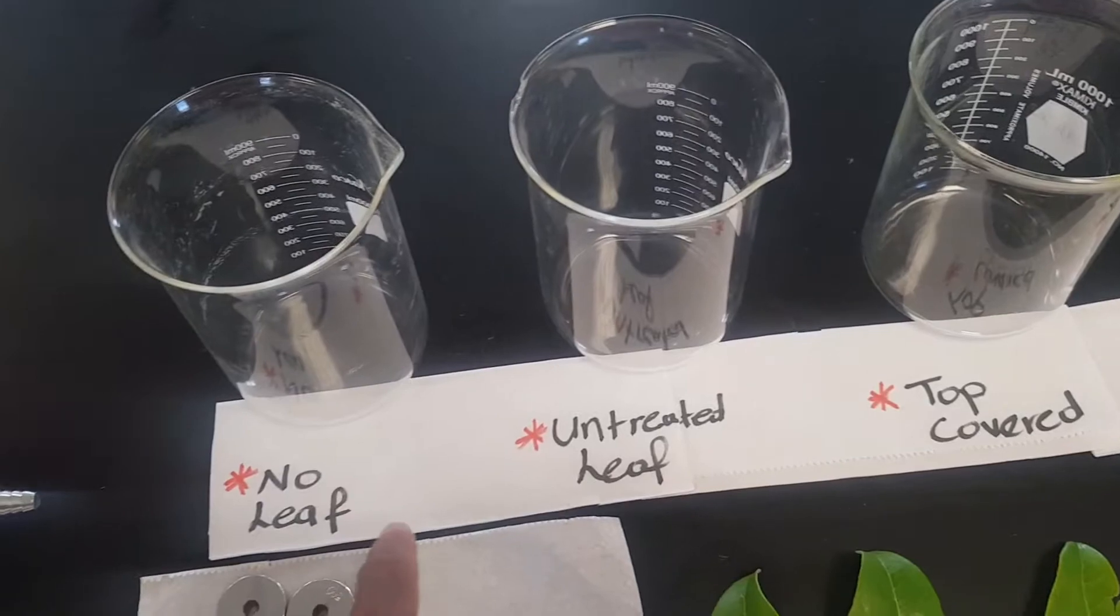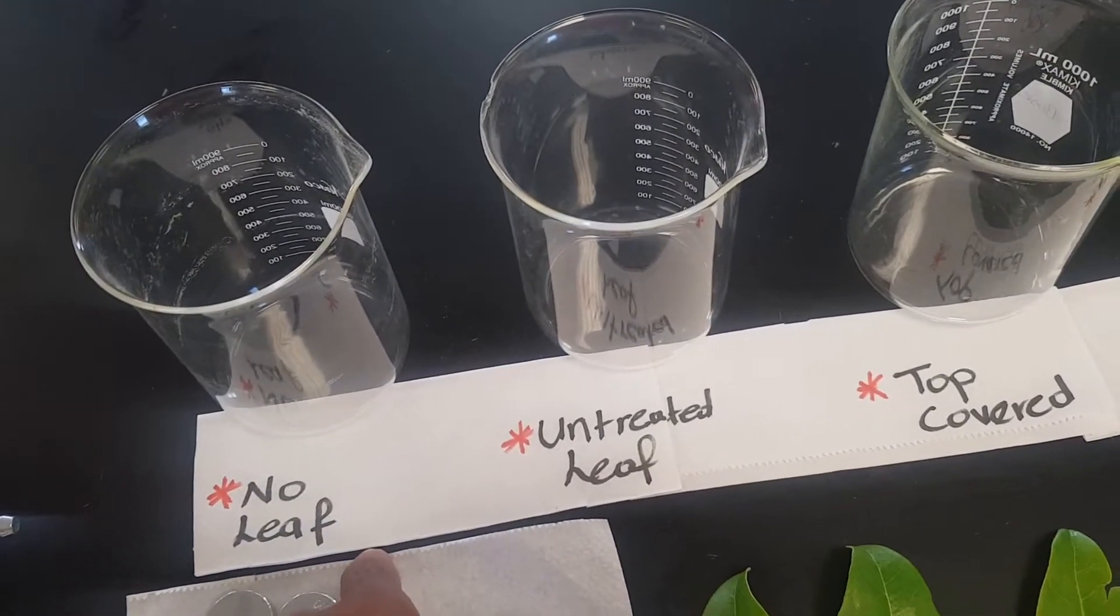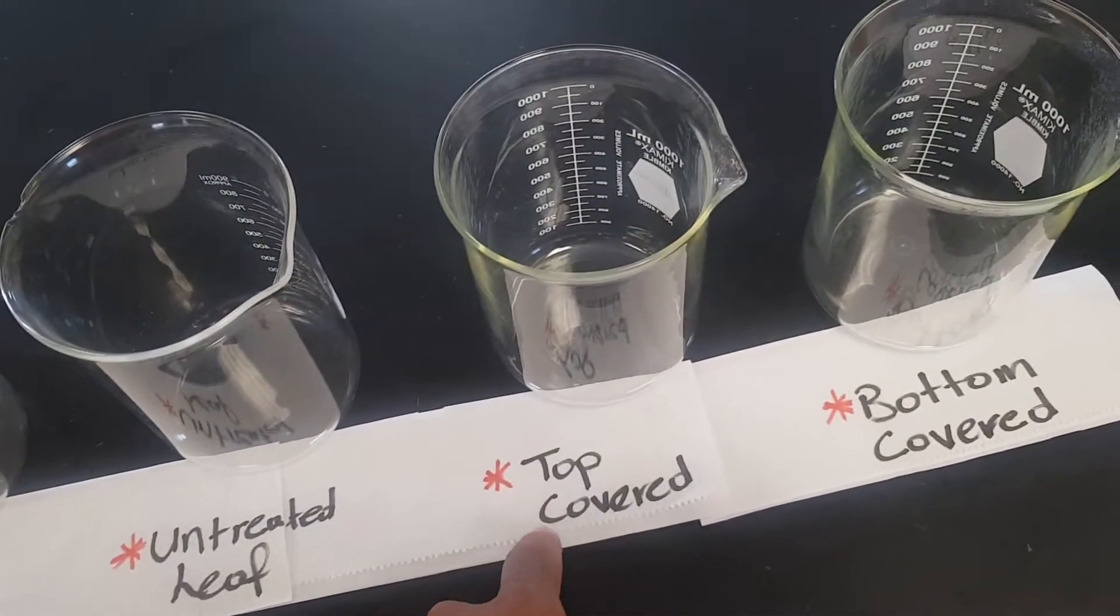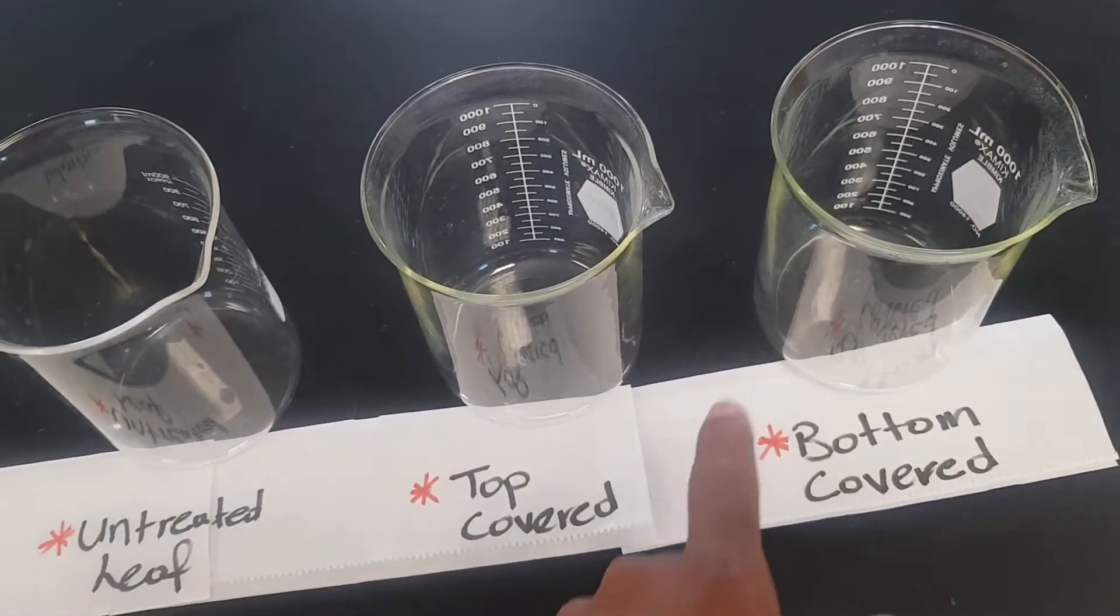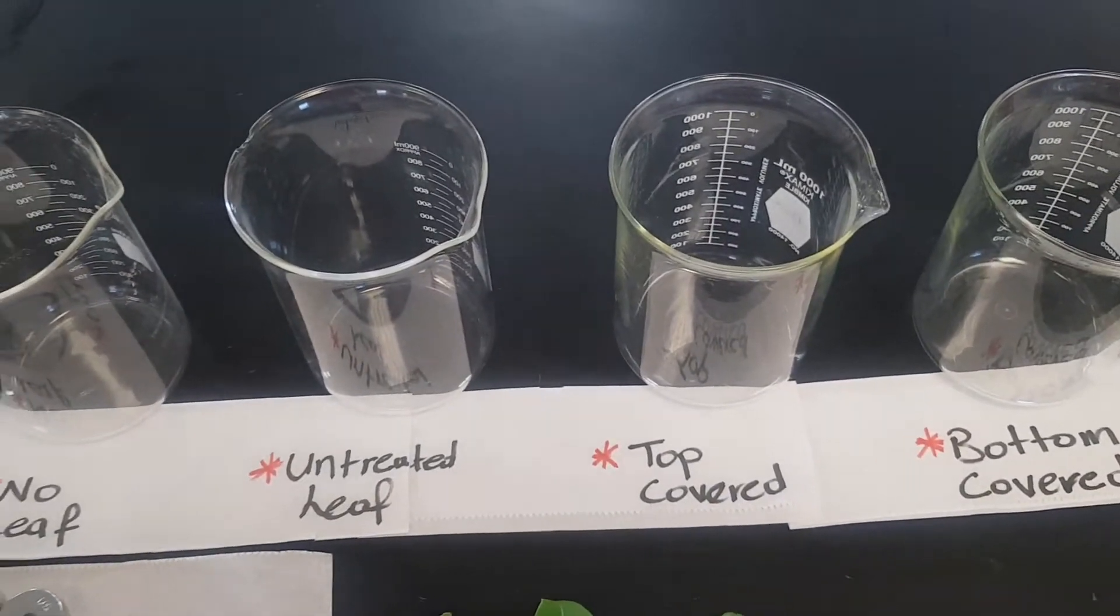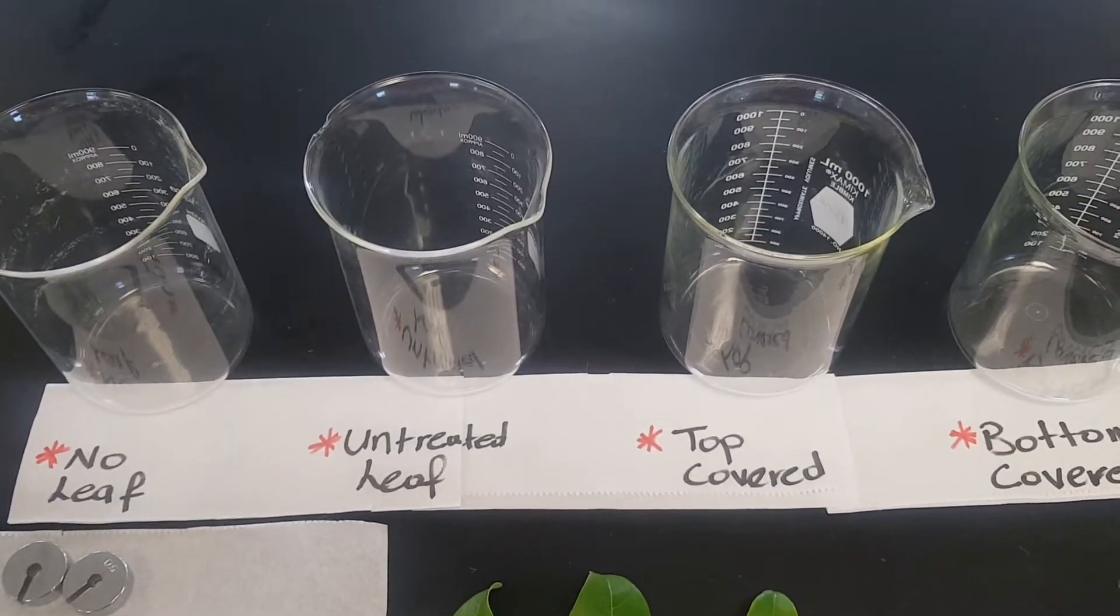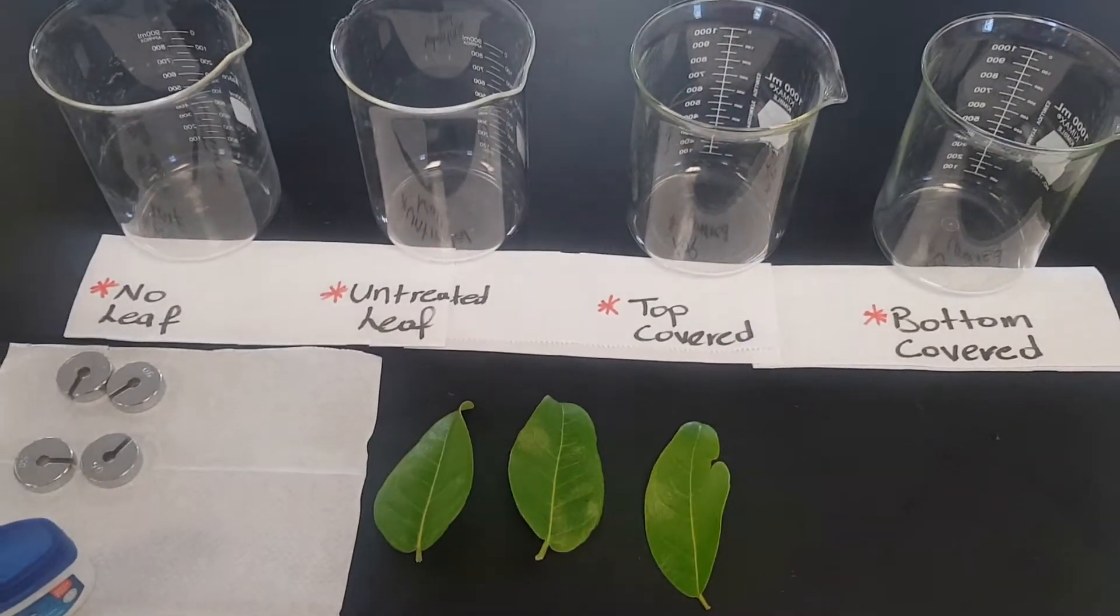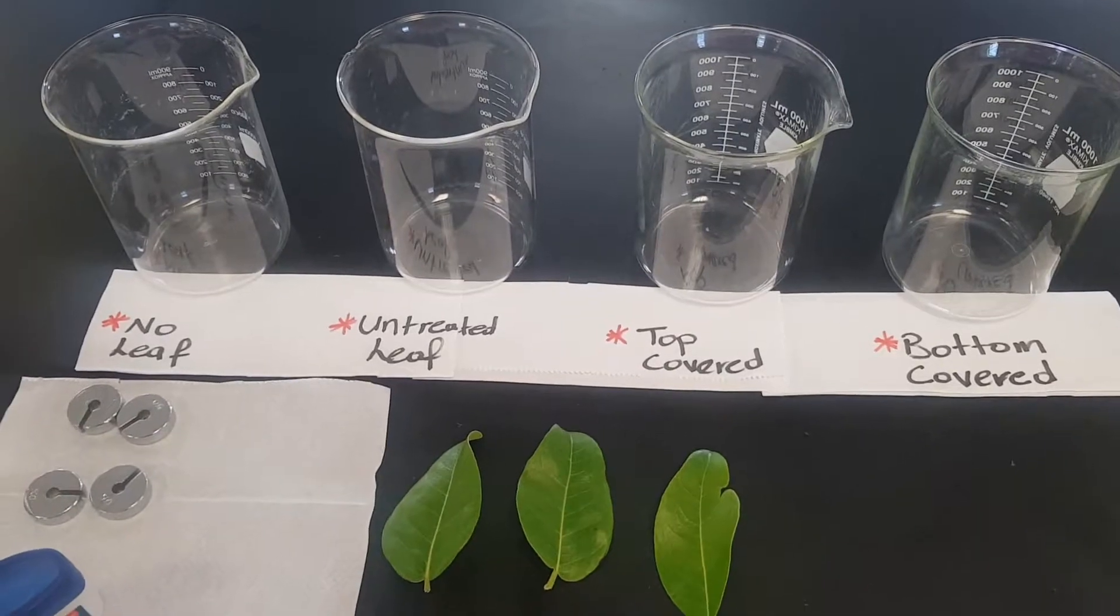The leaves will be treated in terms of: no leaf in this beaker, untreated leaf, the top will be covered, and the bottom will be covered. We'll determine which side of the leaf will produce the greatest amount of gas, and that will indicate which side of the leaf has the greatest number of stomata.